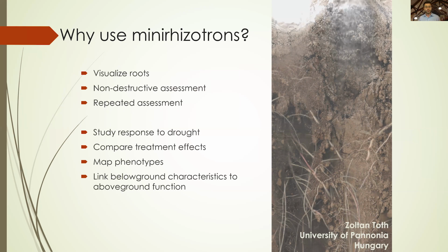So getting back to root study, a lot of studies are very much destructive of the roots, which makes it hard to visualize the roots in their natural biome, do a non-destructive assessment and see how they grow, and do a repeated over-time assessment of growth, application studies, and pathogens. Since their proposal by J.H. Bates back in 1937, mini rhizotrons have been constructed with a successive list of technologies, starting with just mirrors, in order to visualize roots and provide a means to non-destructively and repeatedly assess root conditions.